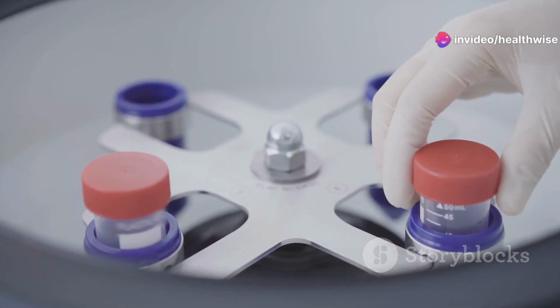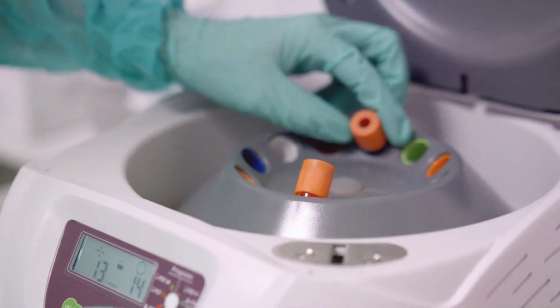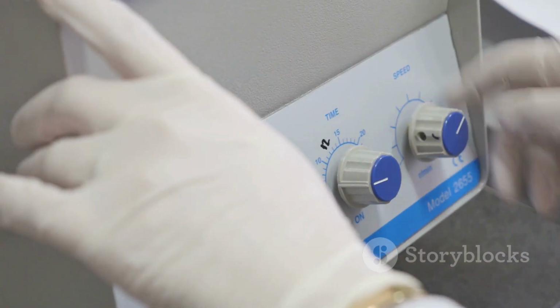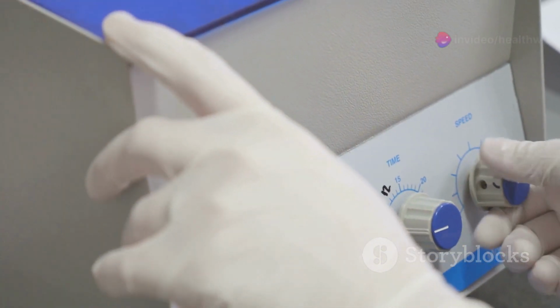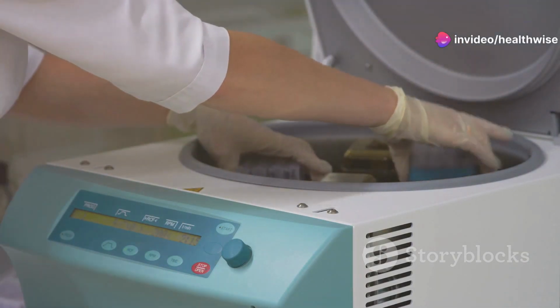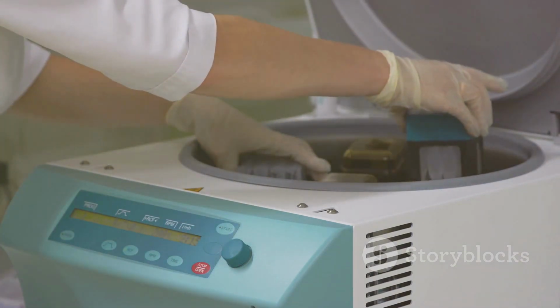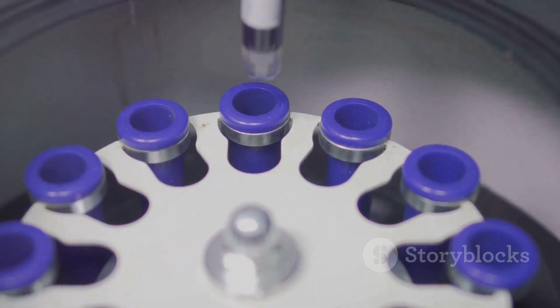Of course, there are a few other important parts too. The lid keeps everything safely inside while the centrifuge is spinning, and the control panel lets you set the speed and time for each spin cycle. Some centrifuges also have a refrigeration system to keep samples cool during operation. By understanding these basic components, you'll be well on your way to mastering the centrifuge.